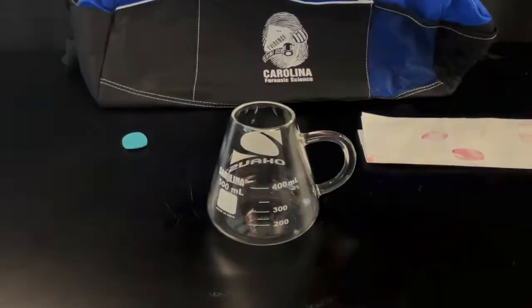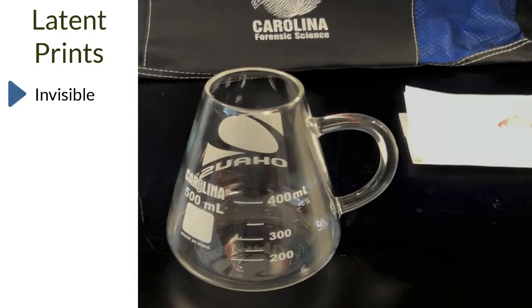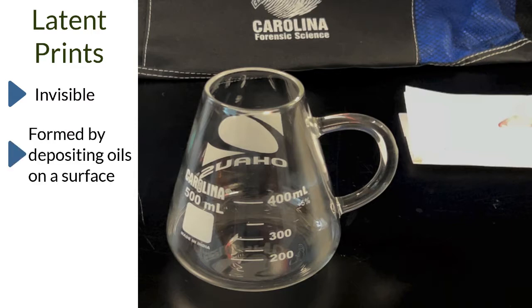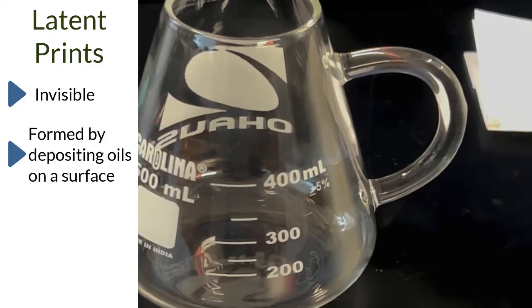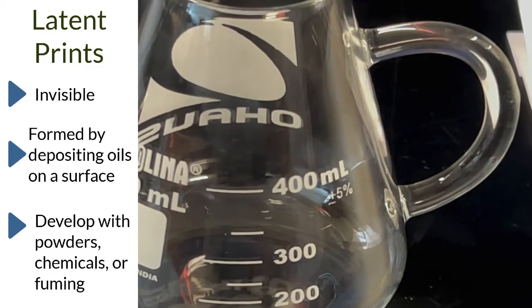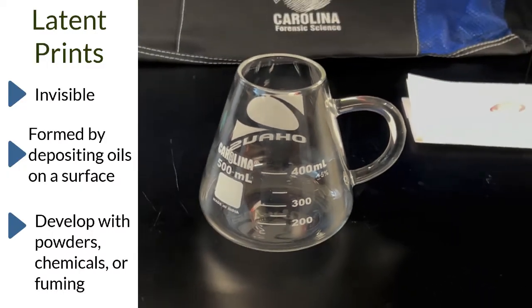The next type of prints are latent prints. Latent prints are invisible prints formed by depositing natural oils on a surface. They must be developed to become visible. Three common development techniques for latent prints are powders, chemicals, or fuming.